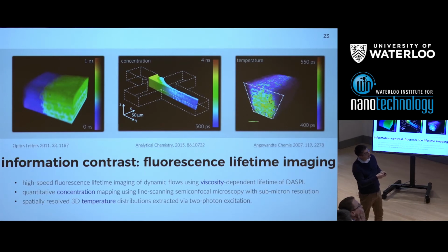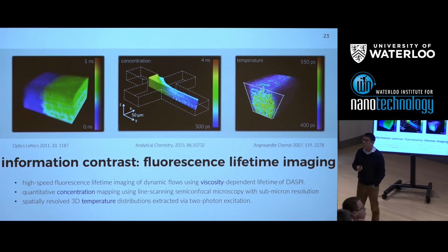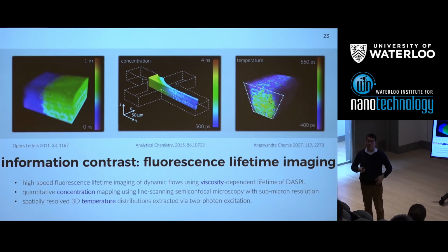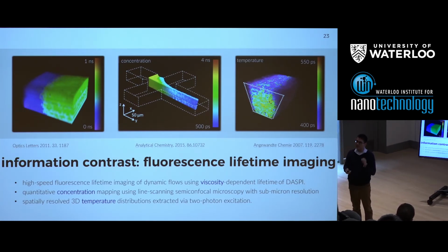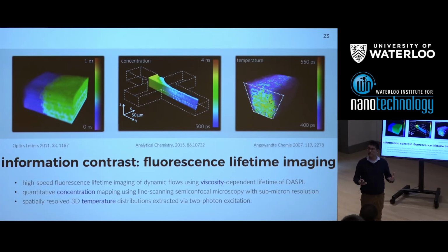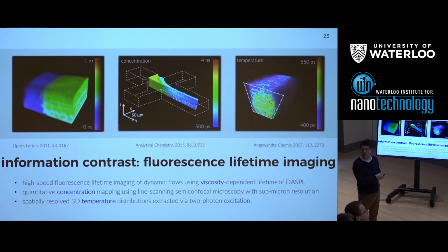And then perhaps my favorite here is by using FLIM to measure temperature. When we were developing the continuous flow PCR device I spoke about, I told you how it worked. That was very nice, but we had serious problems getting it to work perfectly. And one of those was because we had temperature heterogeneity within the system. So what we did here is an experiment where we're looking at a 50 micron by 50 micron chunk of a microchannel. We're heating it with a heater at the top, and then we're looking at the color here as a way of reporting temperature.